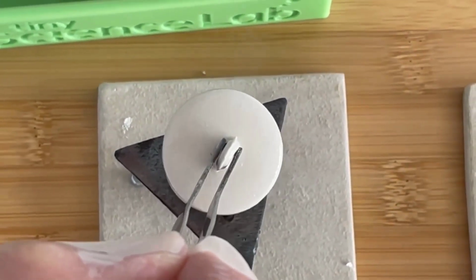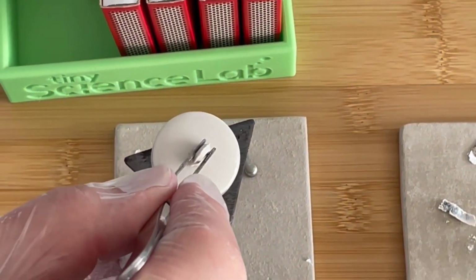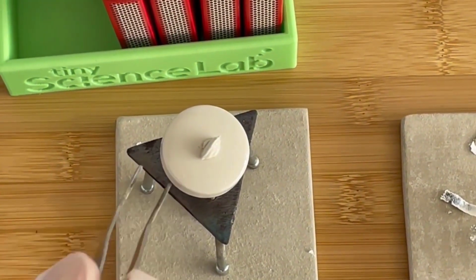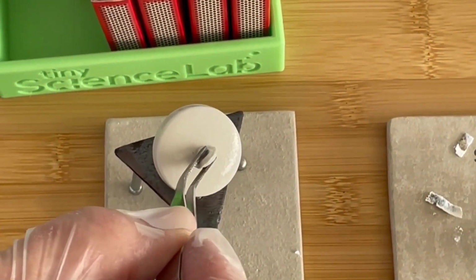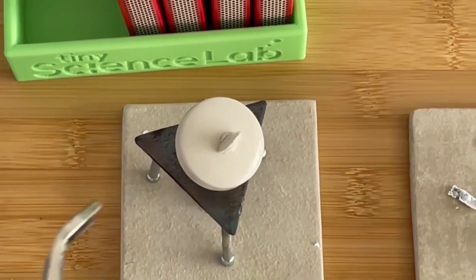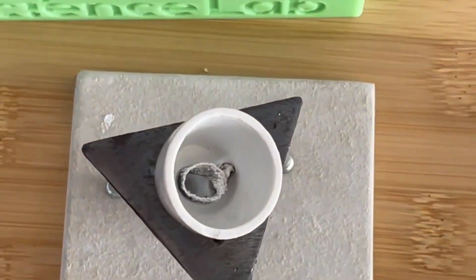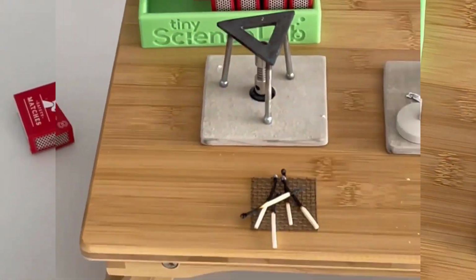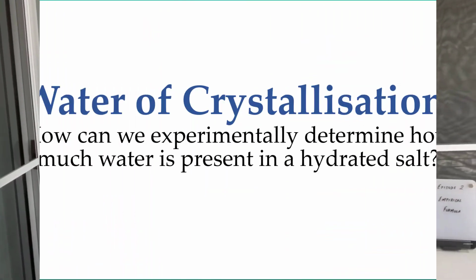So one of the problems you can see with this is once it's going, a lot of that white magnesium oxide powder is escaping. And that's actually going to reduce the mass of the final product. So think about that as one of your potential sources of error for this experiment. I'm going to have a quick look in there. It's looking pretty good. So I'm going to turn my Bunsen burner off. Let's have a look at this product now. Okay, you can see it's pretty much, most of that's reacting. I don't want to weigh it just yet because it's going to be extraordinarily hot. So what we might do is have a look at another way of calculating empirical formula.